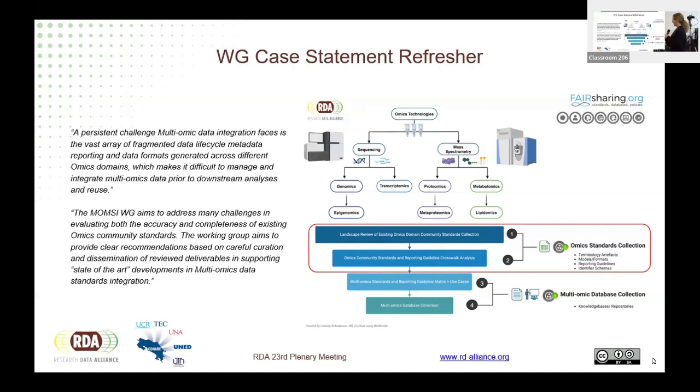Just in case, because omics technologies are comprised of a lot of different instrumentation, and really this working group is very focused on what's almost subject agnostic, even though there is a lot of subject matter investigations in these areas. So here are some omics technologies that we're focusing on. Specifically sequencing and mass spectrometry as the core technologies, and then genomics, proteomics, and metabolomics as our core parent domain spaces. So you're either very domain heavy expert in one or another.